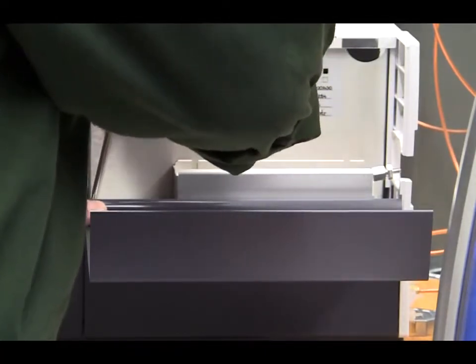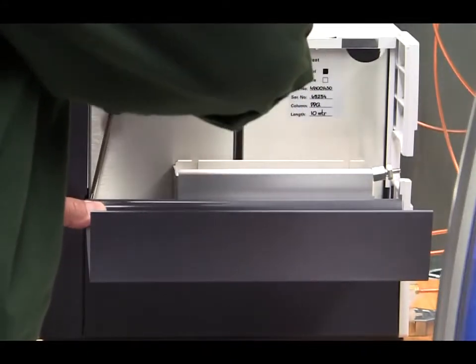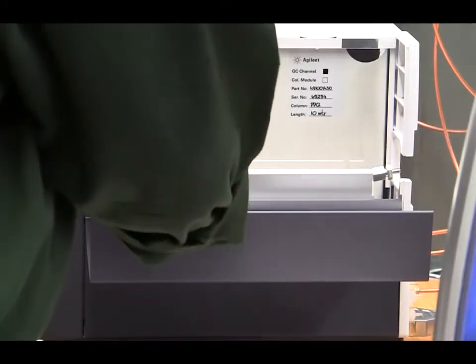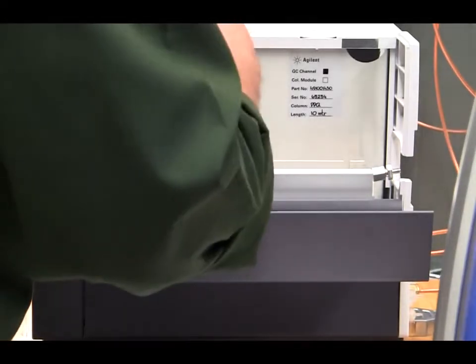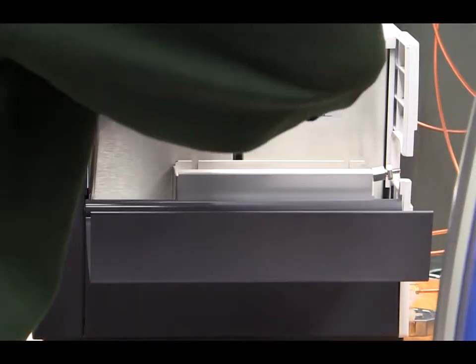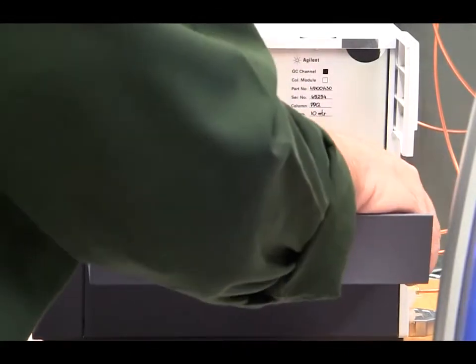How high up in the hydrocarbon range do you think you might have to go, Doctor? Not very high. Just the C3s, probably? That's good. PoraPLOT works really well for that, but if you wanted anything higher, I'd want to go with a different kind of column.